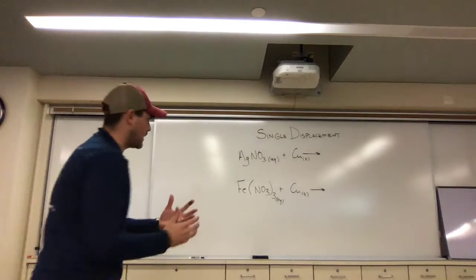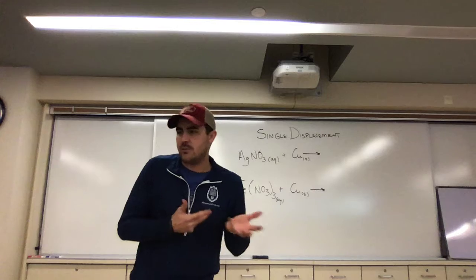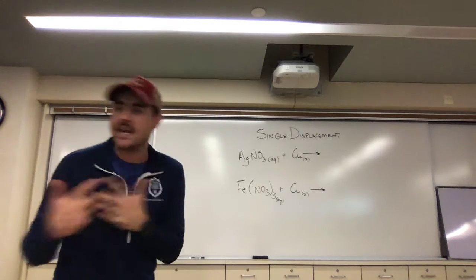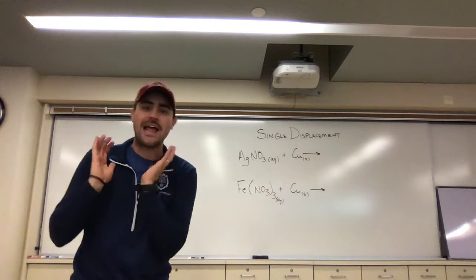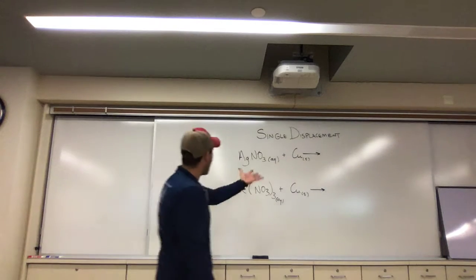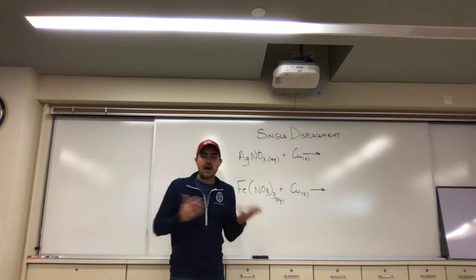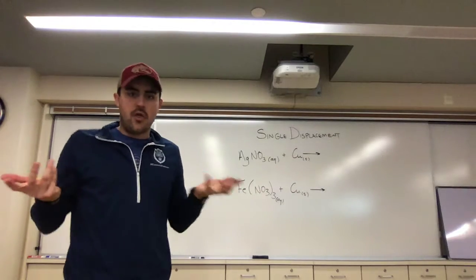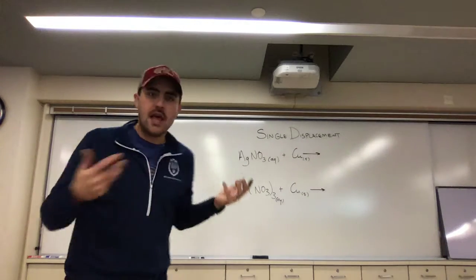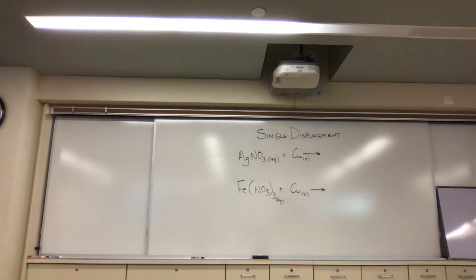I found both of these in the classroom, and I was wondering to myself, well, if they're aqueous salts, aqueous solutions, ions in solution, and I have this solid copper, elemental copper in the classroom, I could definitely see their reaction, right? Without predicting the products, I can go ahead and see, are these going to react? I think they should. They're chemicals. I wrote an equation. They should react, right? Let's go ahead and check to see if these two reactions happen here in the classroom.